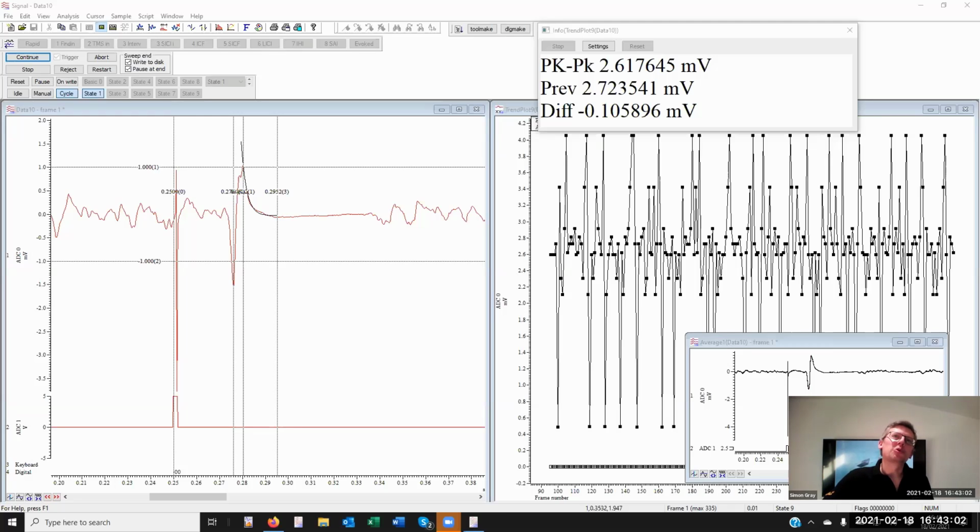Simon again will talk much more about the single channel analysis and dynamic clamp next week, but we'll look at some of the patch clamping data in just a couple of minutes. For other, can you give me a quick idea in the chat what you're using that for, please? Okay, thank you for that.